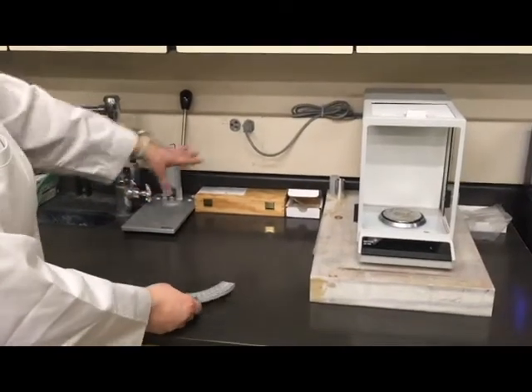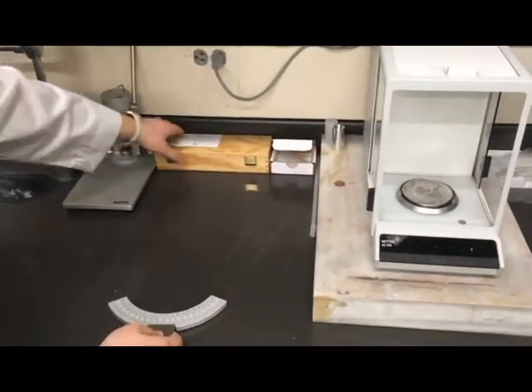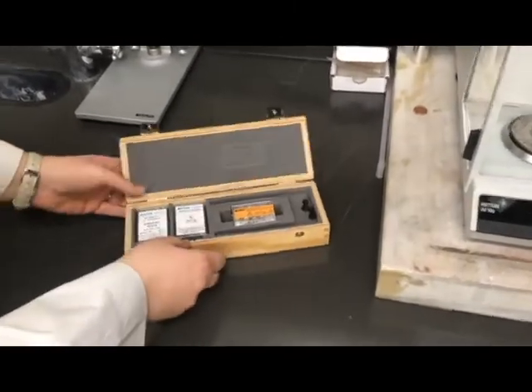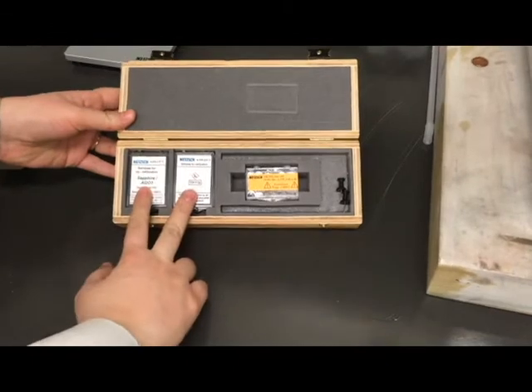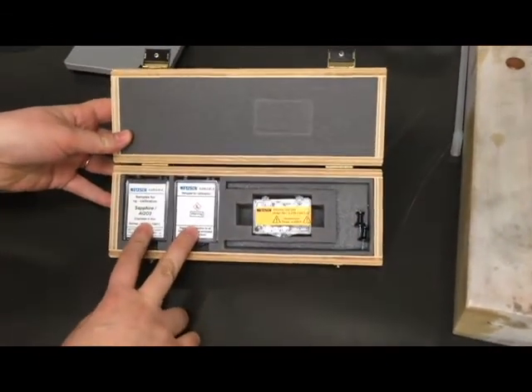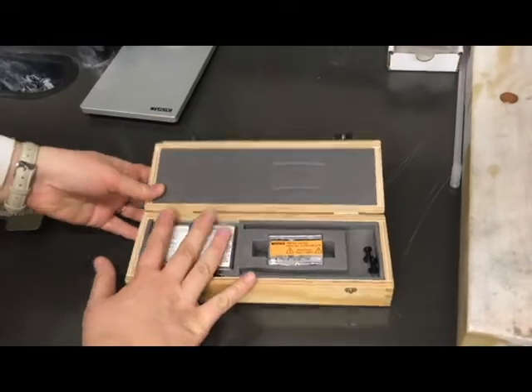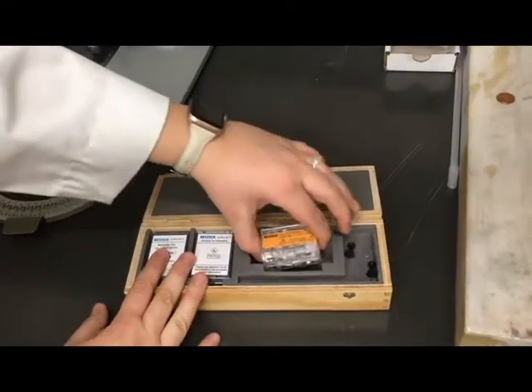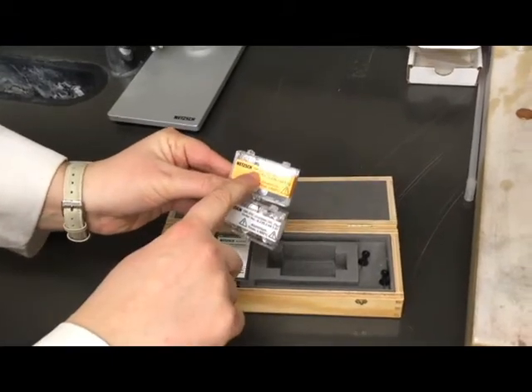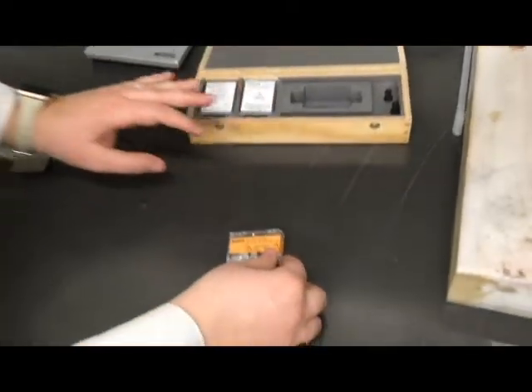This is where we do sample prep. We've got our sample card from the auto sampler right here. Inside this wooden box are all of the pieces we're going to need. The two samples I use for calibration — we calibrate approximately every six months — we'll just leave those there. On the side we've got two containers: the orange container is the lids, and this white container is our crucibles. So we're going to pull out one lid and one crucible.